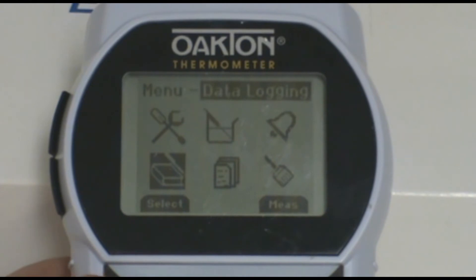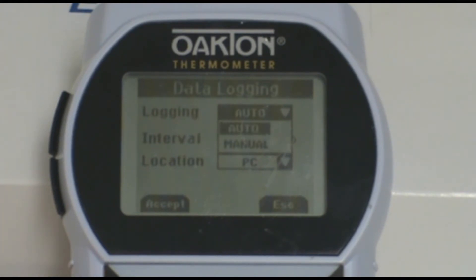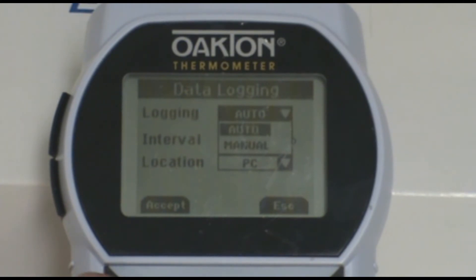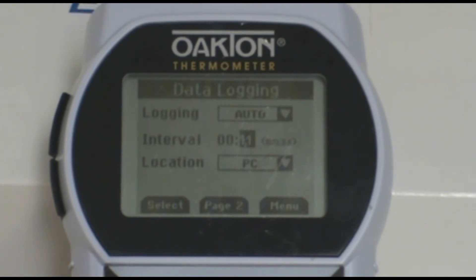You can then adjust your parameters based on what will work best for your application. To change each parameter, make sure the field is highlighted and then press the select button. You can then use the arrows to scroll between the different options. For location, make sure it is set to meter, and for logging, set it to auto so that it will automatically take a reading after the time interval you have set passes.